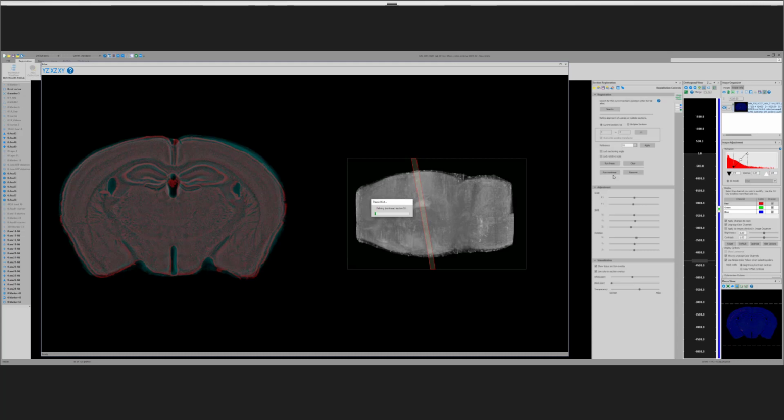Sure, I'll jump in. As Chip said, the linear registration is really good at finding where in the brain we are, but it doesn't represent all the variation within each section. That's what nonlinear registration does. Instead of the handful of parameters that represent how a knife cuts through the brain, the nonlinear model has hundreds or potentially thousands of parameters. Those parameters enable us to incorporate local adjustments that account for tissue distortion, whether caused by the knife in the cutting process or simply by differences between animals.